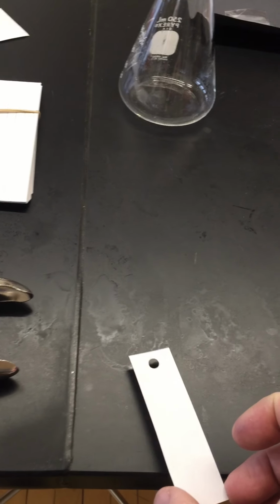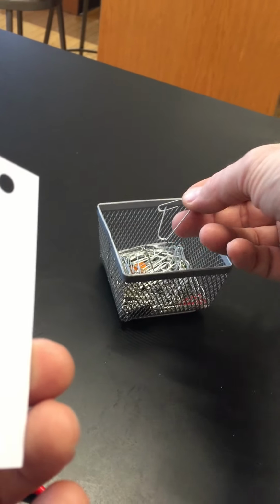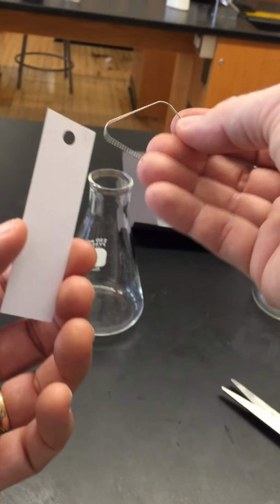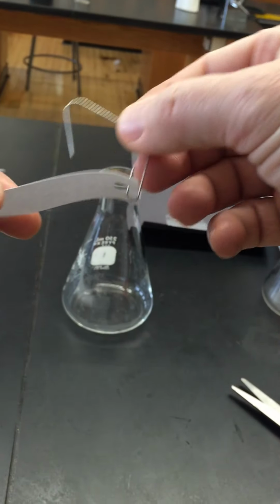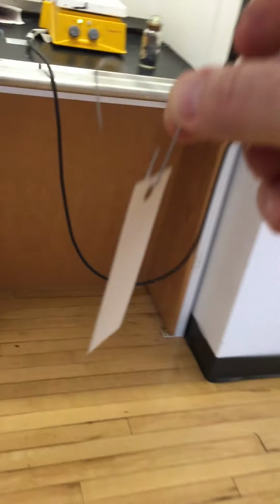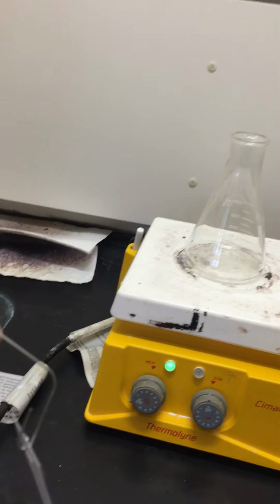Okay. I'm going to take a paper clip. Somebody's already made one for me. I'm going to hook it through. I'm going to use this to hang the card on the side of the Erlenmeyer flask. So here's my setup.